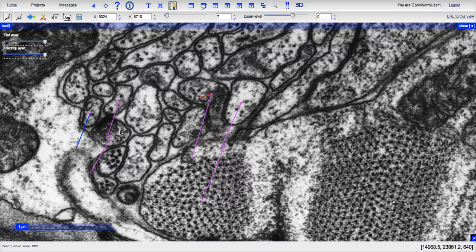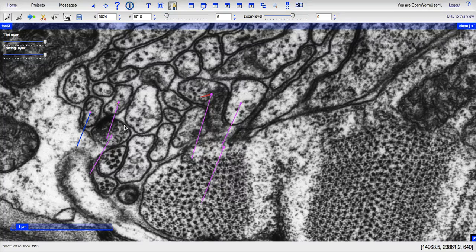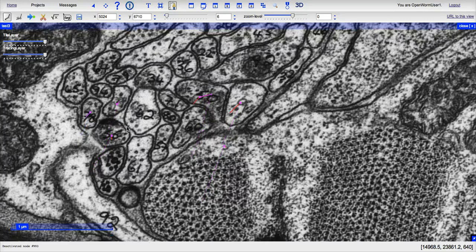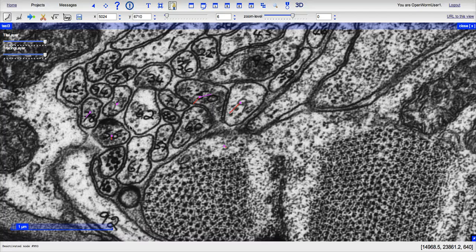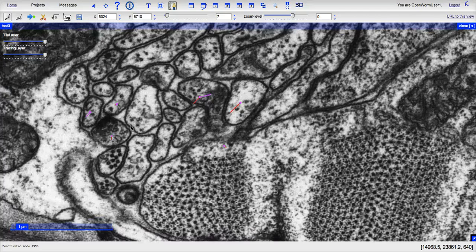Again, you can see the presynaptic density. The vesicles aren't quite as clear in here, but as you can see, the presynaptic density appears to span for more than one section in this image.